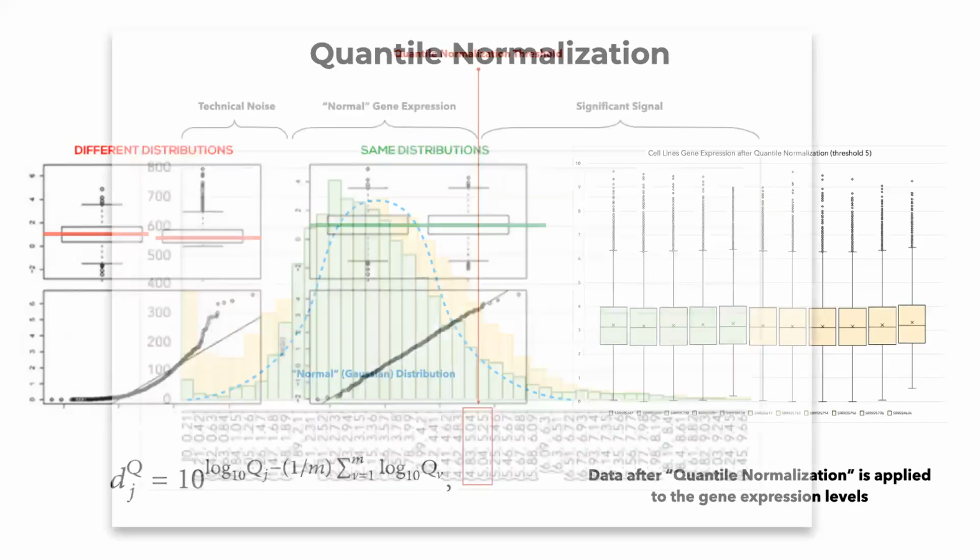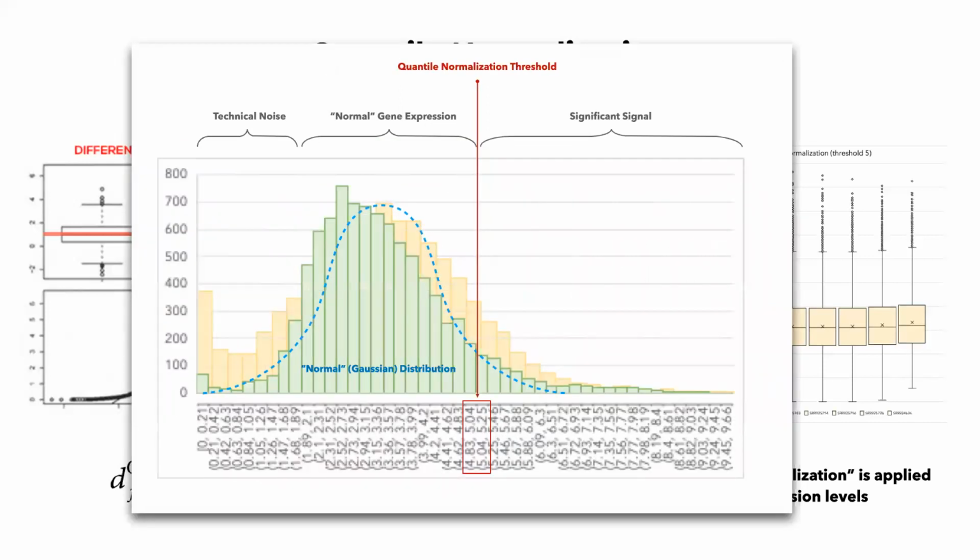So when we do quantile normalization, we can take a threshold, and that threshold will help us eliminate the technical noise. We want to eliminate the technical noise, that is the really low expressed values. In the middle, we will have what's called normal gene expression, the genes that are common between the majority of whatever cells we take. And then the significant signal is going to be on this long tail of the distribution. That is where we will typically find most of the information when we want to compare different signals in our data.